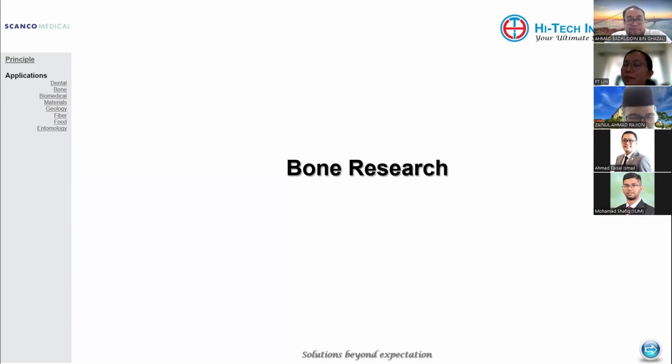Prof, also, my experience when I was in MINT, Malaysia Nuclear Technology, they have a Scanco micro CT. It's also located in a room in the lab, something like that. Yep. Okay.